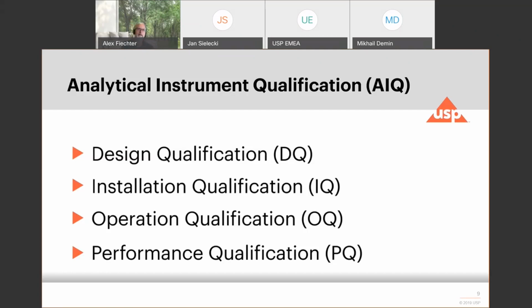Because remember, the general chapter 711 was developed many, many years ago with dissolution apparatus that have not been designed the way they are engineered today. So everything is much tighter, much smoother, much better. For those testers these days, complying with the standards in 711 is a given.